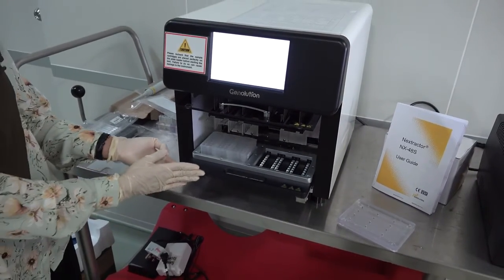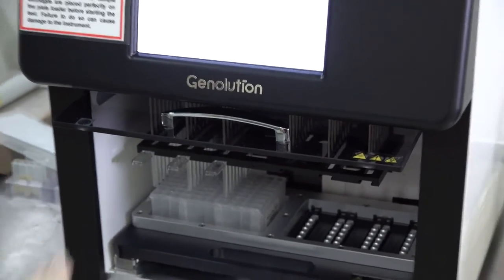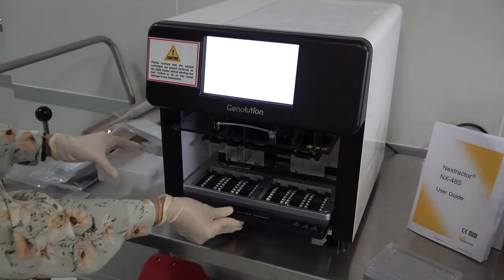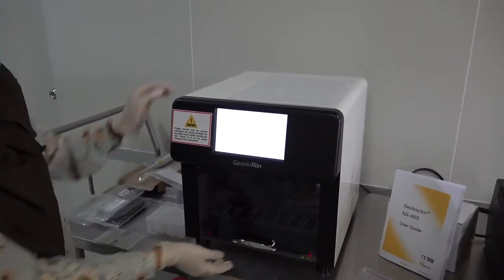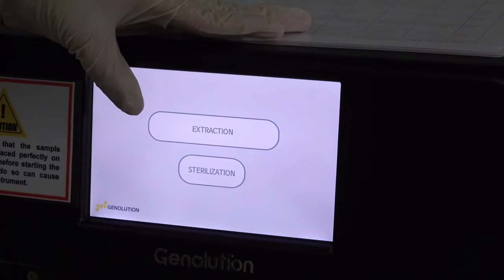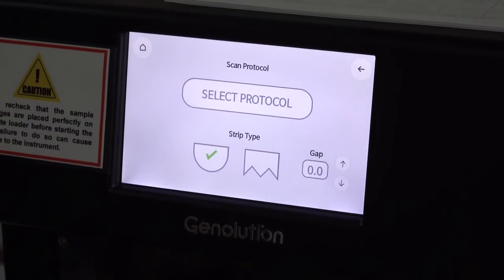Now we will view the basic setup of the instrument. We will move to the menu file. Let's go down to the standard menu. When you turn on your menu, you have to select Extraction. Once you select Extraction, you have to select the protocol.